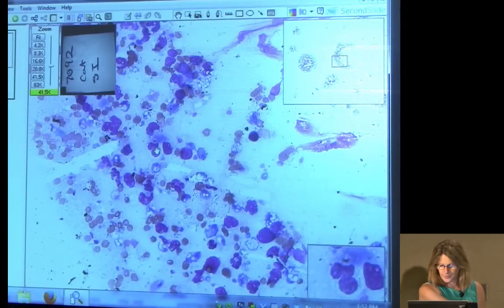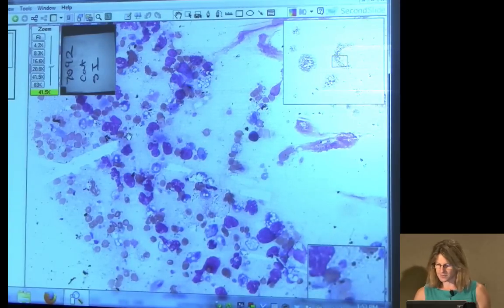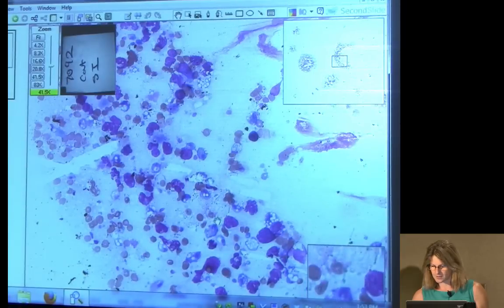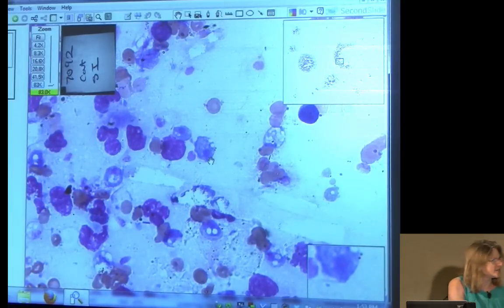So that's a neutrophil, and this is a slide from a friend of mine. There's lymphocytes here. That's a lymph. I can recognize that. I think these are macrophages. And so there's mixed inflammation. There's definitely a neutrophil here. And then there's this organism here in the background. And I don't think you're going to see it on here, which is such a pity because it's really pretty. But these, oh yeah, you can see it. Can you see the flagellae?